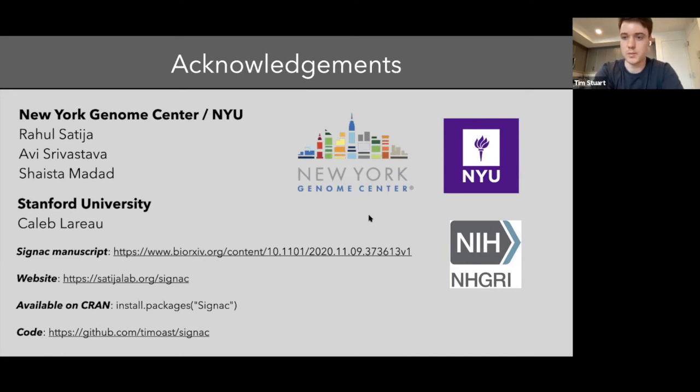So that's something that we're particularly interested in, where you have big references that are high quality data sets that we've built and then map a query to it. Again, I haven't really done a comprehensive comparison between Harmony and our LSI integration for scATAC-seq. My guess is that they both perform fairly well, and they're also easy to run. So you should certainly try running both and see what works well for your data set.